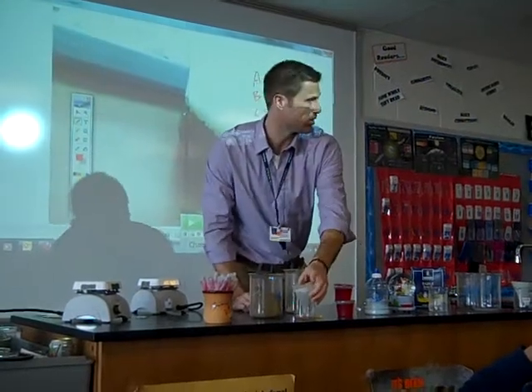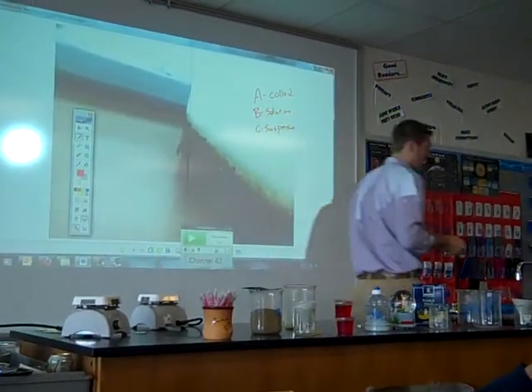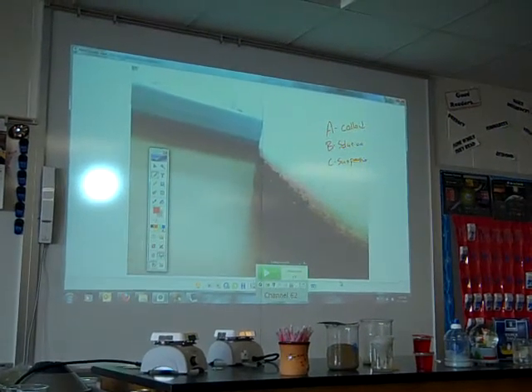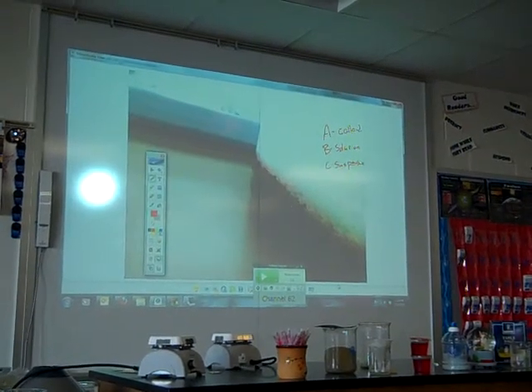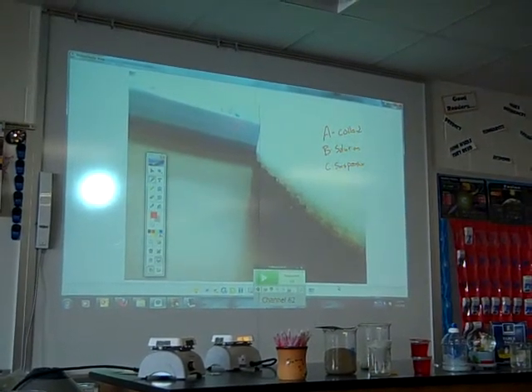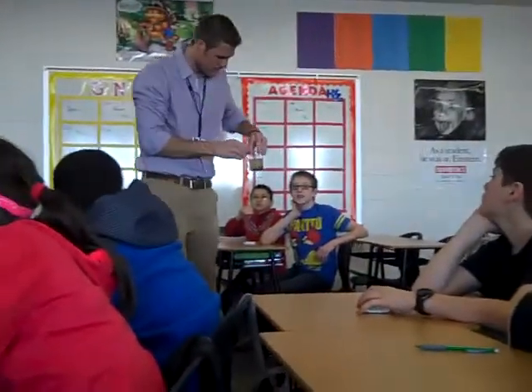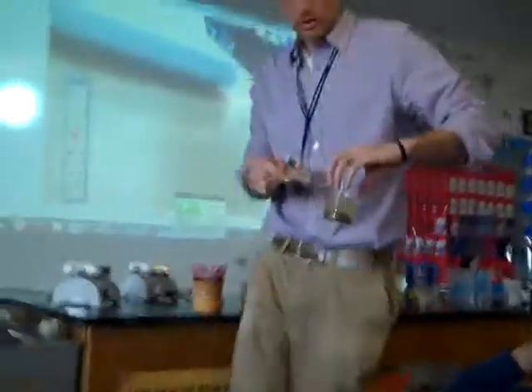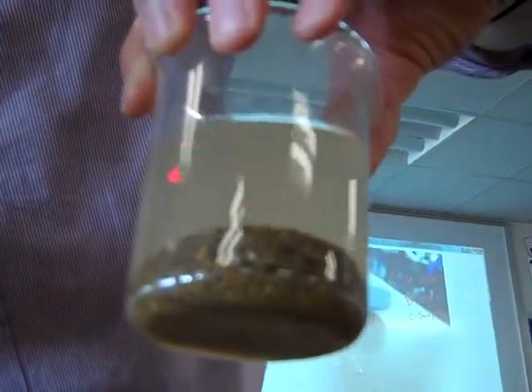What are some other tests that we can do? Does it scatter or spread light? So here we go. Let's see. You guys see that? See the red line? That is cool. Here, I'll come around and show you. You can see. So does it scatter light? Yes. You see that, Professor Mullen? Yes. Nice.